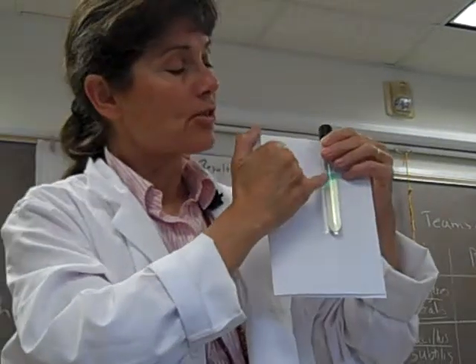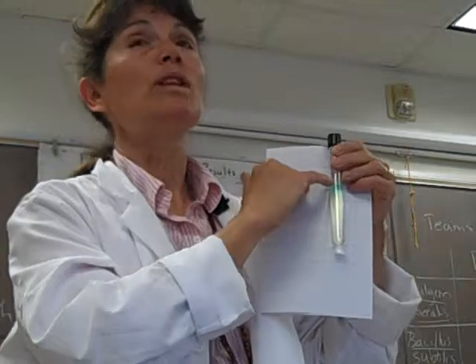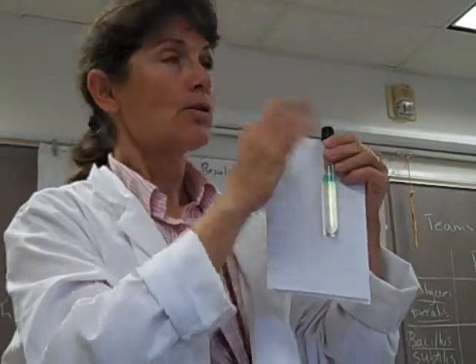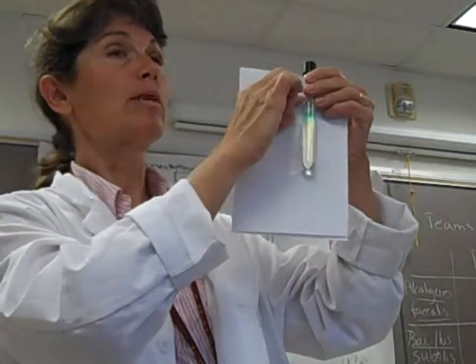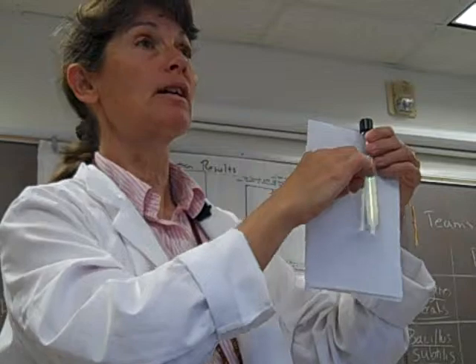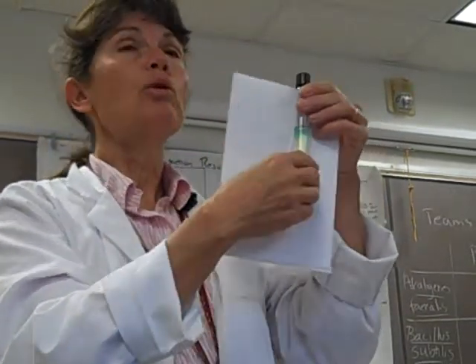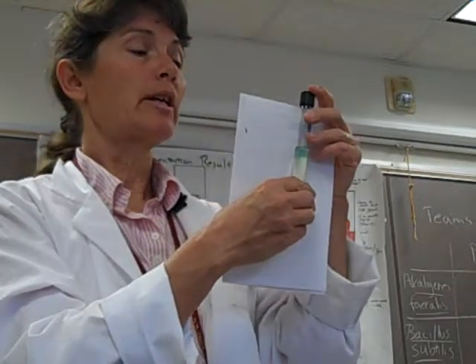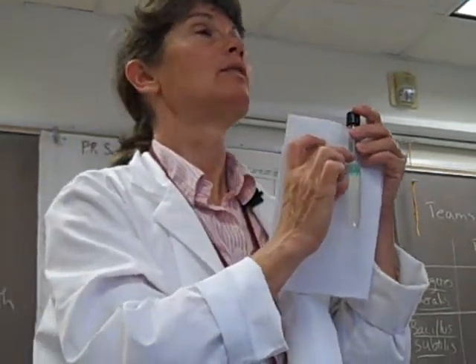Now, in addition, there's an oxidation reduction indicator in the media, and it turns green when oxygen is present. So this makes sense. We've got a little aerobic zone up at the top where we have a little bit of molecular oxygen continually diffusing into the media. The rule of thumb is you never use thioglycolate media if more than 1/3 of the tube is green.